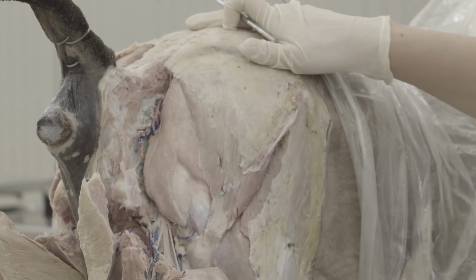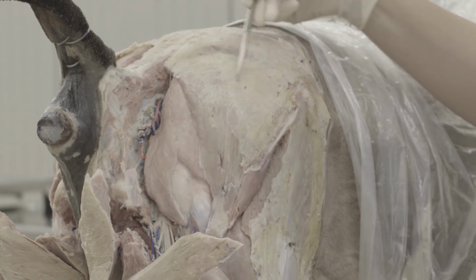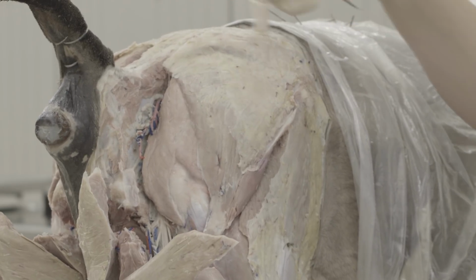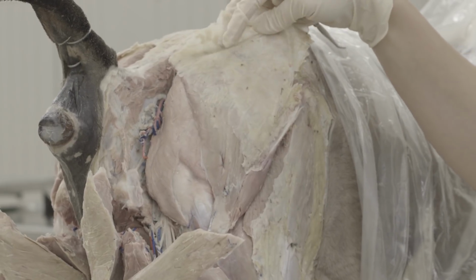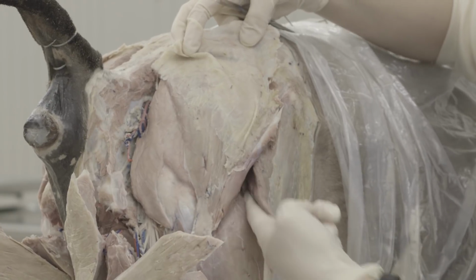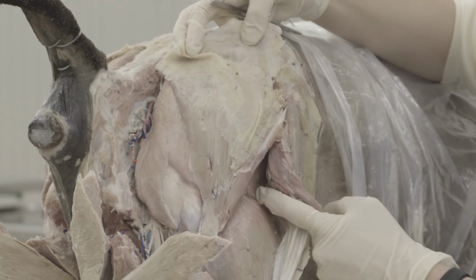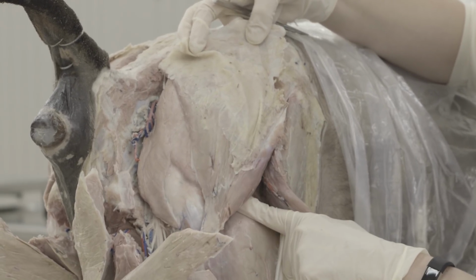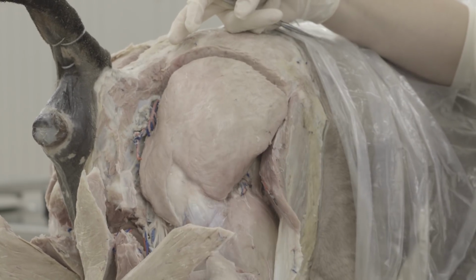So you have your superficial gluteal, which is that V-shaped muscle with the aponeurosis in between the two parts of the V. So take a little bit of that aponeurosis with it, cut across, and then reflect distally. So you're cutting proximally, reflecting distally. And again, if you need to, you can move part of this tensor fasciae latae muscle out of the way, so you can just reflect it cranially if you need to get to that other piece of the superficial gluteal here. So here is superficial gluteal, reflect that distally.